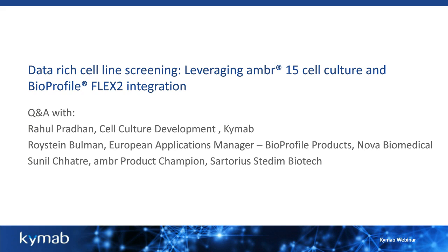Okay, just scrolling through the questions again. Is there a feedback loop where the FLEX2 can feed values, i.e. pH or glucose values, back to the ambr system? Yeah, absolutely. And as you can see from some of the data, we implemented both of these feedback strategies. And yes, you can have most of the parameters in various equations that you want.